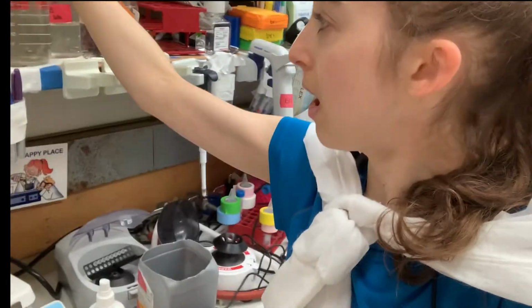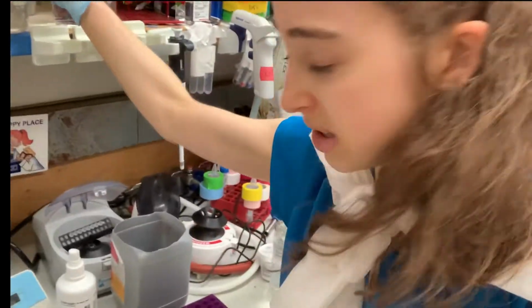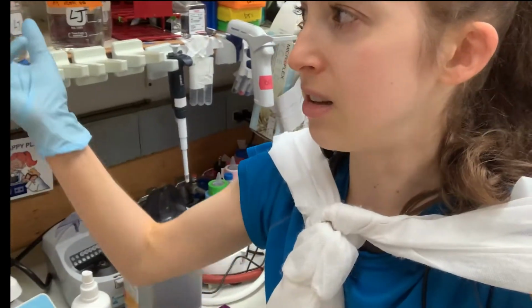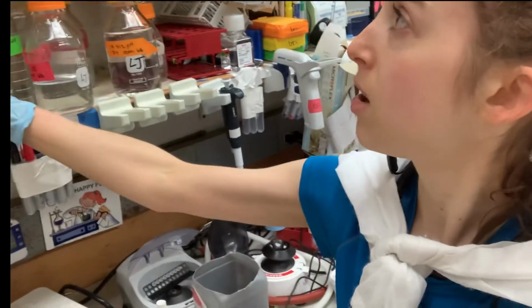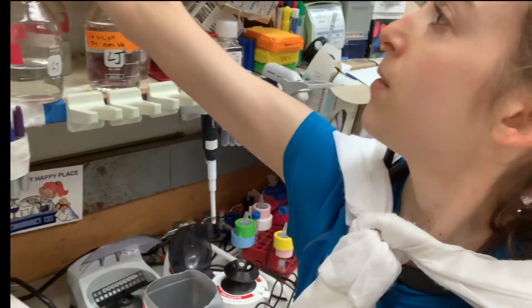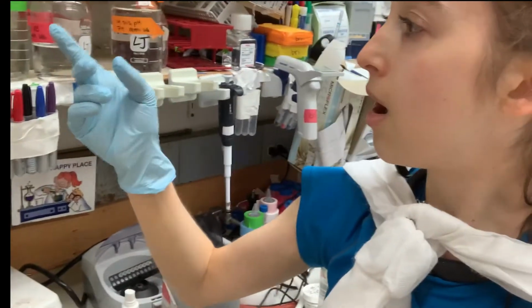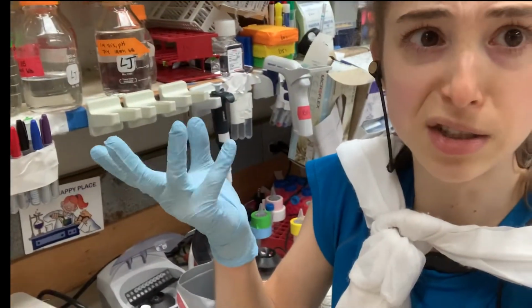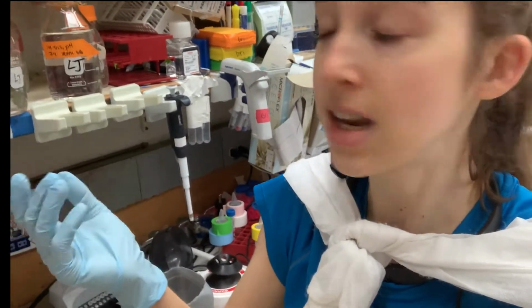But anyway, I do something similar. I have common buffers that I use. We typically call all our solutions buffers, even though technically the buffering part is the pH buffer that we put in it, like Tris or potassium phosphate buffers or HEPES. I have various ones. But basically we call any solution a buffer, usually if it contains some sort of buffering agent in it.